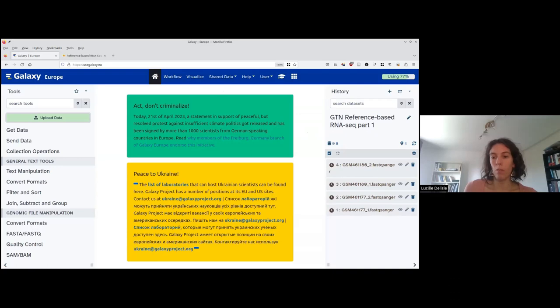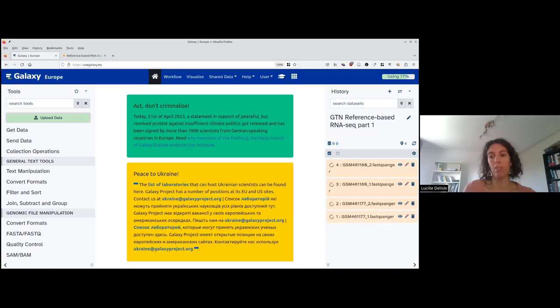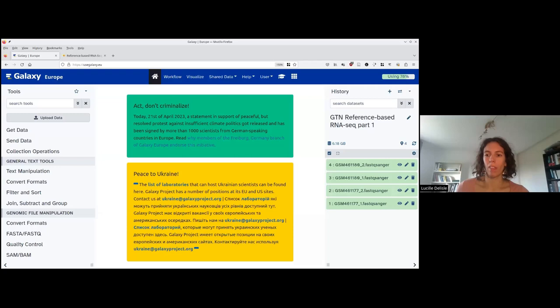The datasets are initially gray, meaning they are waiting in the queue to be launched on the Galaxy server. When they are yellow, they are running, and when they become green the download is finished. I will pause the video and wait until they become green. The four datasets are now green, which means that the upload is finished and I will be able to use them to process within Galaxy.